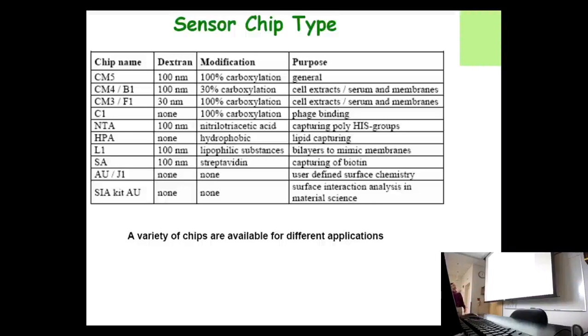And the other thing is, down here at the bottom, you have an NTA, which actually is related to the column that we use in Biochem 2 to purify. Julia, Rosemary, Afra, your poster is going to include nickel NTA. In fact, I think it's in the title, isn't it? You can actually get a BIAcore chip that has NTA on it. And we got it. It actually works okay. You can get one for lipids. Basically, if you can figure out how to chemically attach it through a covalent bond to a chip, you can either buy or make a chip for it, for BIAcore.